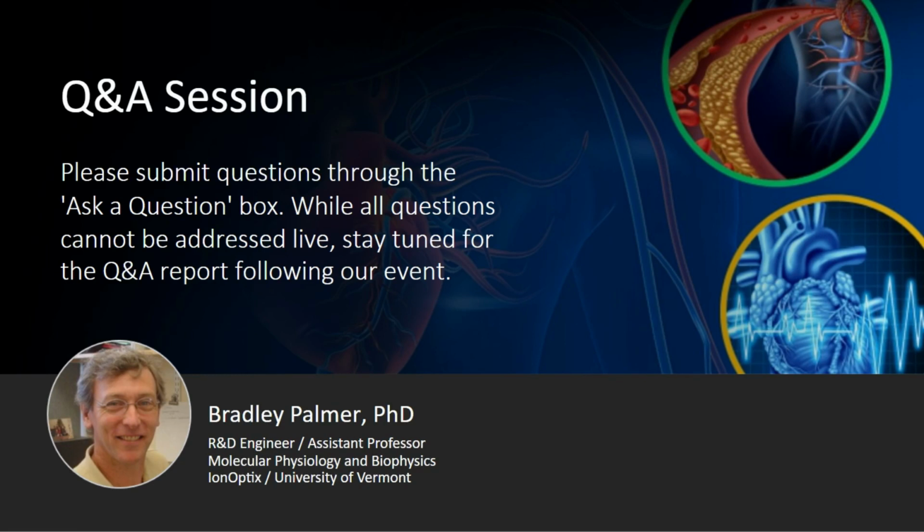Interesting, the point about it being an intact syncytium. But do you get issues with areas not stimulating quite the same way as others, perhaps due to variance in excitability or orientation of the fibers, etc.? We haven't observed that. Now, we're not the kind of laboratory that examines action potential propagation, but there are other groups that have, and in their control cardiac slices, there's a nice propagation of the action potential throughout the entire slice.